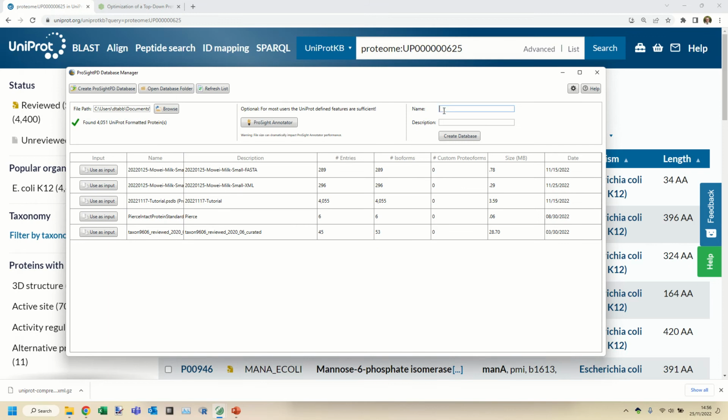Now we need to have a name that we use with this database, and that name should be really specific because it is going to have to clue me in, months to come, that this database is part of this database manager on this computer, and I might want to come back to it at some later date and add another modification on top of what I've already got.